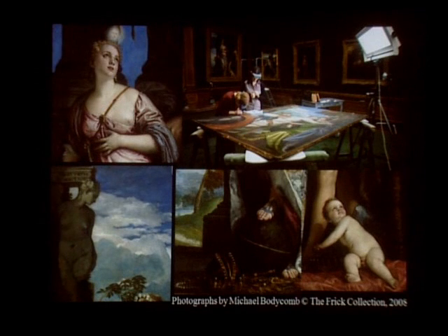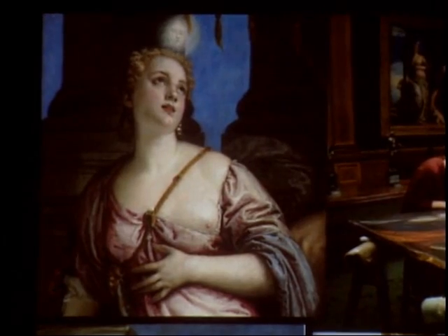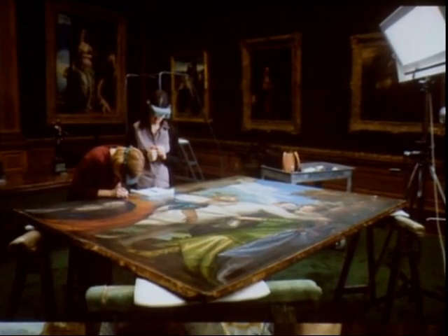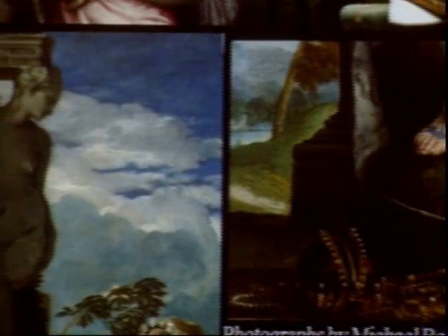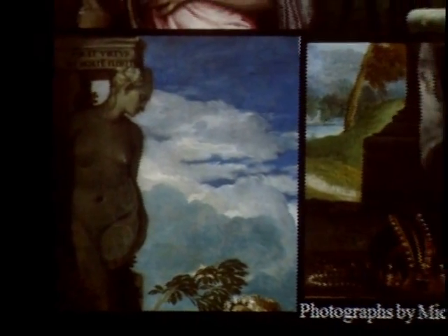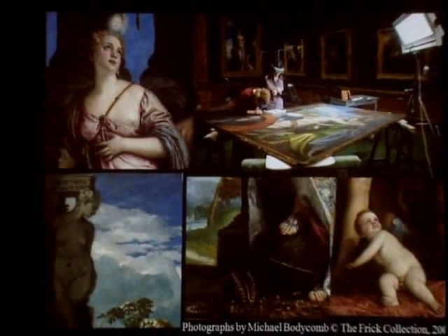The similarities in technique used for the three paintings — for example, the consistent use of a light pink color ground and the complex build-up of the skies with azurite in the underlayers — is not surprising, given that the three paintings date from approximately the same period in Veronese's career. However, the use of very different materials for the supports and construction of the grounds strongly suggests the three paintings were conceived as individual works. We were surprised to see colored grounds used, but this is consistent with the trend for increased use of colored grounds in the second half of the 16th century in Venice, particularly by Tintoretto, Bassano, their workshops, and followers.